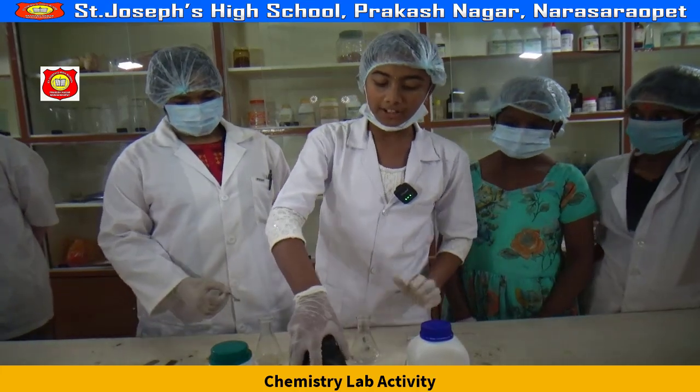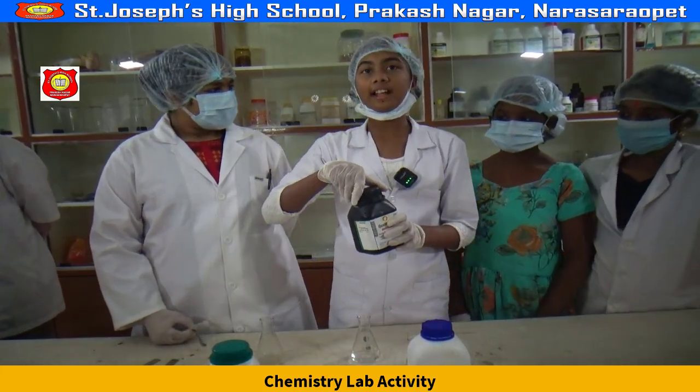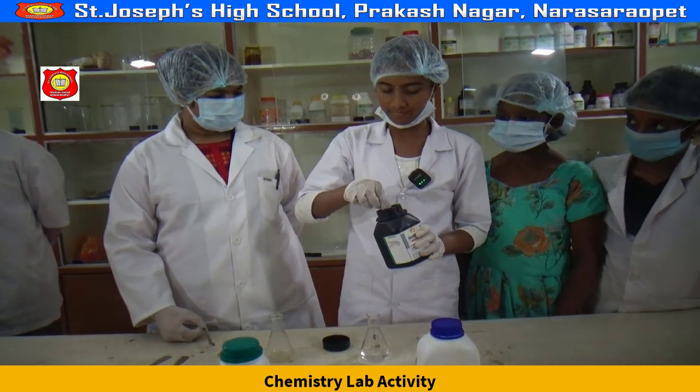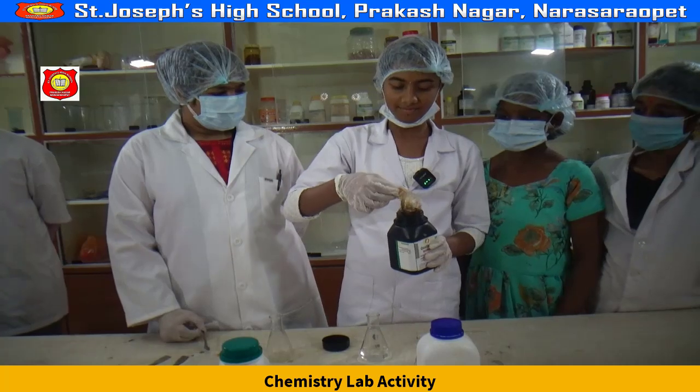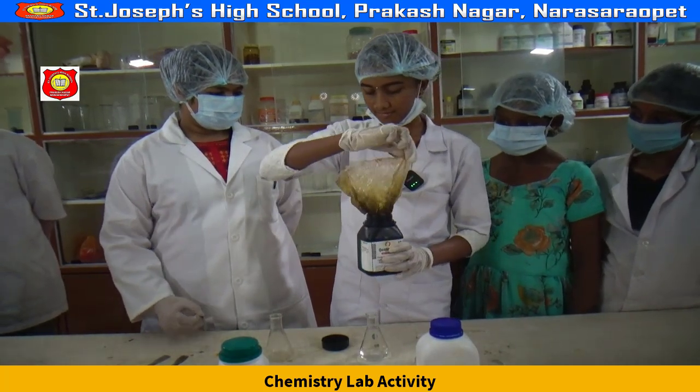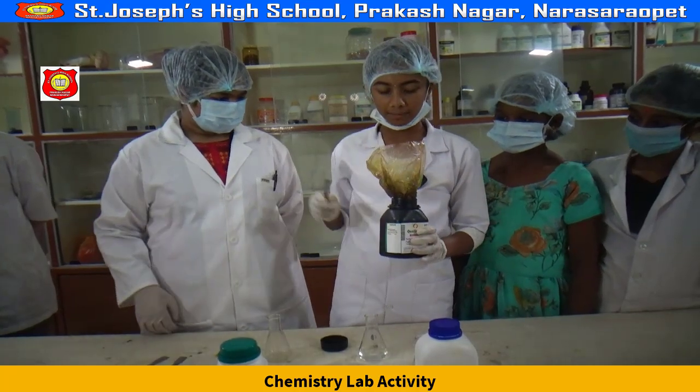Now take another conical flask which already contains distilled water. Now take ferric chloride, which is in anhydrous state. Take a spatula and add it.